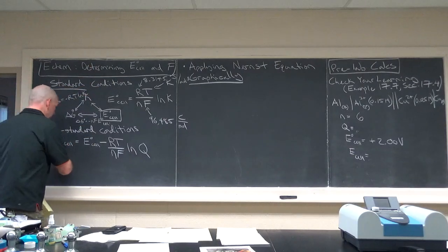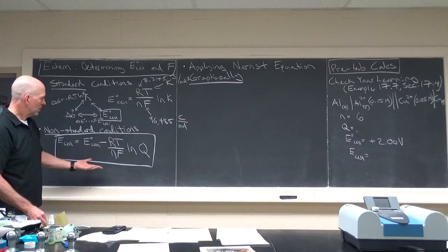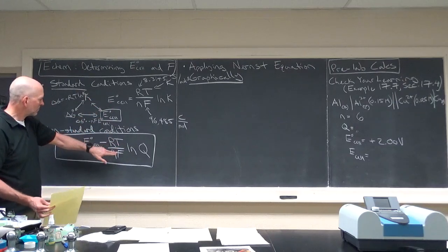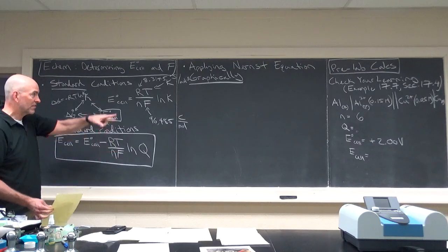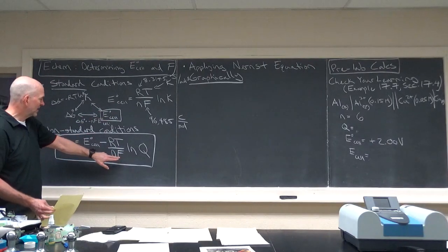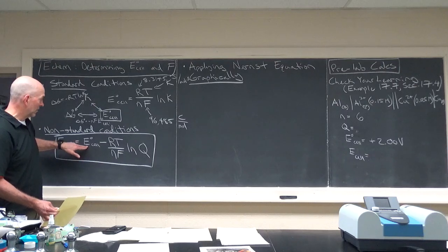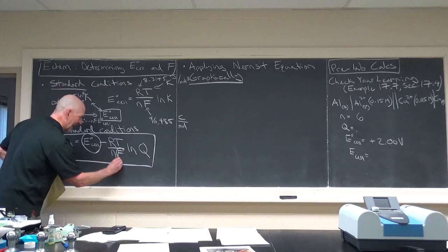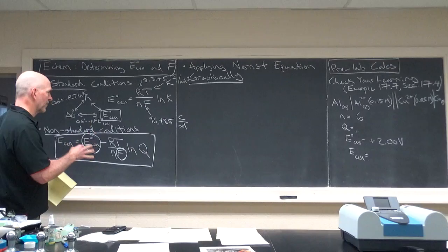Now the Nernst equation is for non-standard conditions. So in lab, you'll record the temperature in the lab. That'll be constant for this. And we're actually going to calculate experimentally the Faraday constant and the E0 cell. So we're going to use experimental data to get this and this. It's a pretty neat experiment. In fact, I've never seen it before. First things first, I'll come back to that.